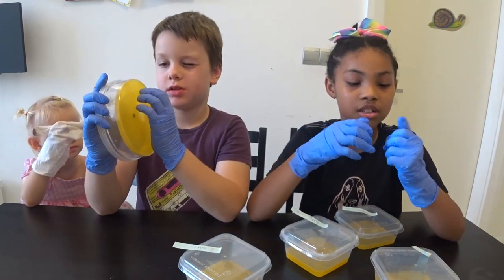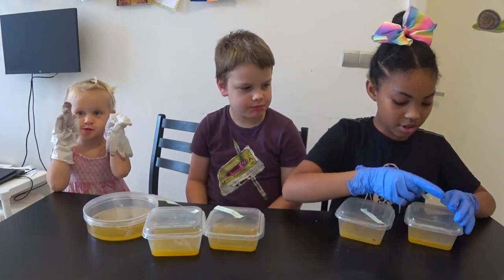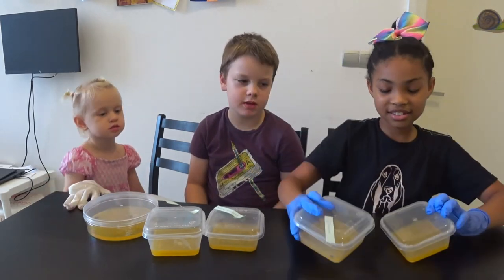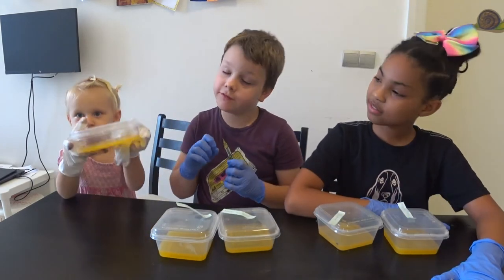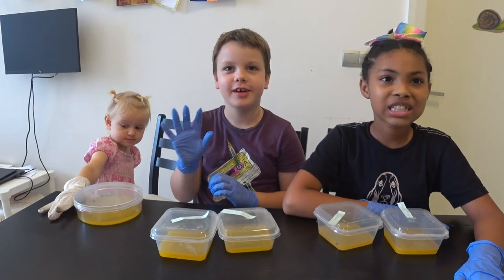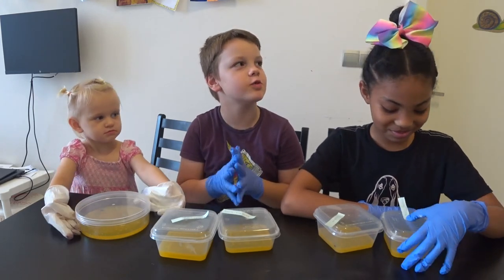We also saw this experiment on YouTube, and it shows the results that there's a lot of bacteria, but for ours, there's just a little bit. I think that's because we have a too clean environment, so there are not so many viruses. Thank you to who cleans all the environment in our house everywhere.